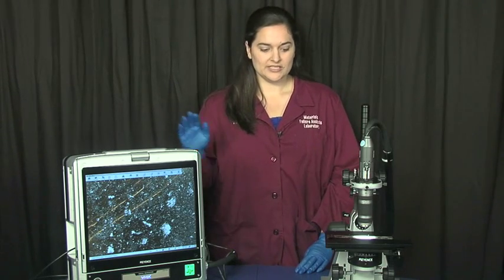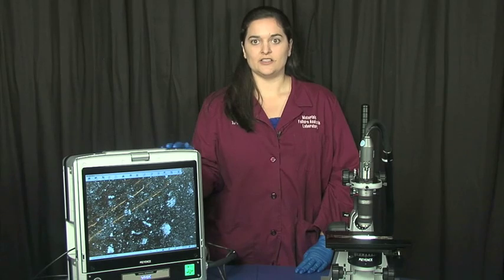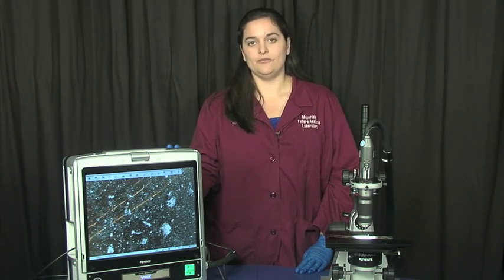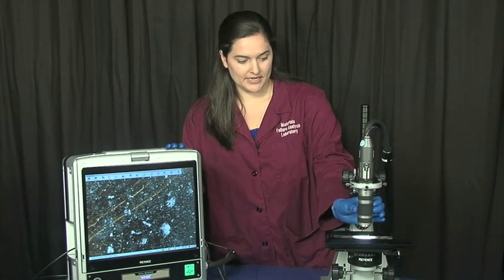When they brought it back, we used this instrument to take a look at it, and as you can see on this screen, there's a lot of different sizes and shapes of fragments. We can use this instrument to go up to 200x magnification.